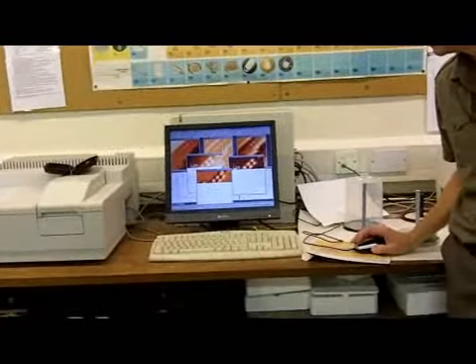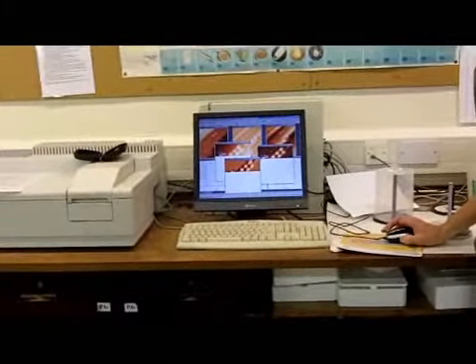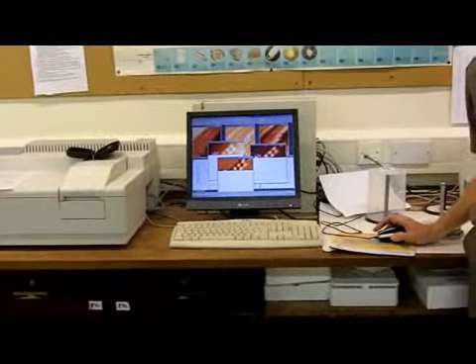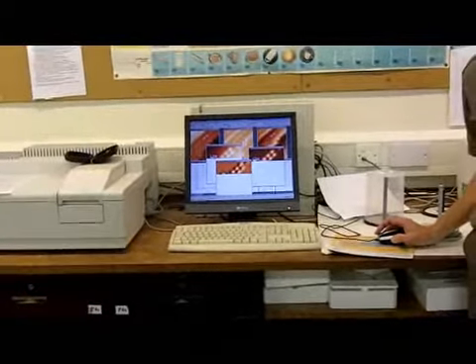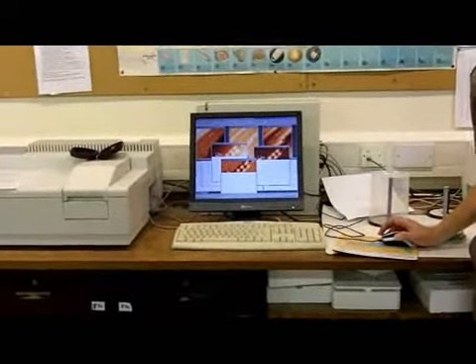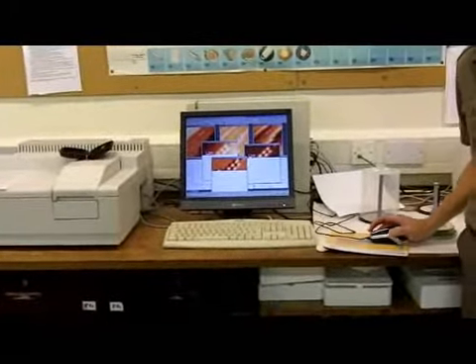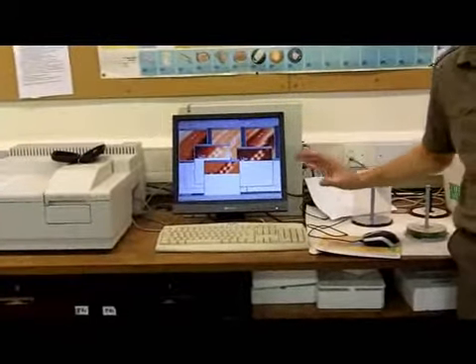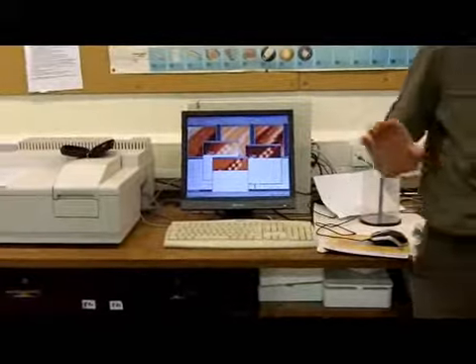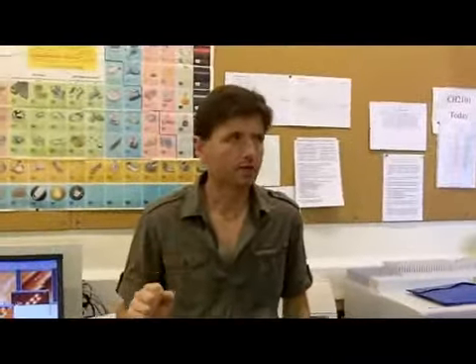And you can see now that there is structure around there, as well as these features that you saw there. Okay. What is that structure? What are those features? How do they relate to each other? Those are the questions that you've got to answer. Okay. So I think that's everything you need to know about the program, the data. Any questions? Okay, right. Off you go then. Go and have fun.